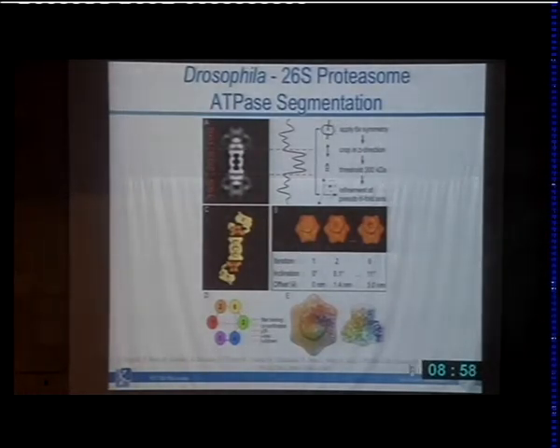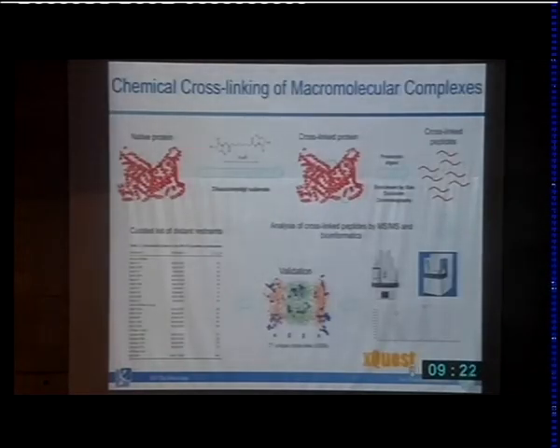We also made a proposal at the time for the order of the AAA ATPase subunits. It was based on published interaction data, a whole range of data, many of them, as a matter of fact, quite contradictory. But the order we determined was 1, 2, 6, 3, 4, 5. And we built then a homology model, and it fitted quite nicely into the boundaries we had determined.